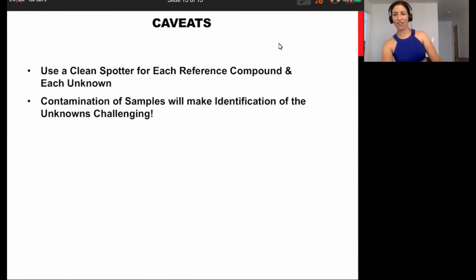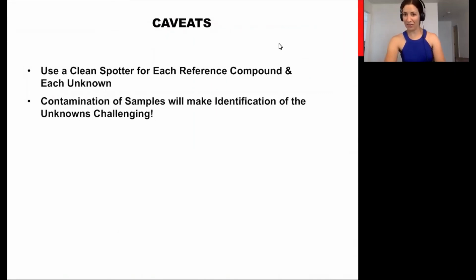Okay, so that concludes the theory of chromatography and all of the ways that it applies to TLC. Remember to use a clean spotter for each sample and to handle your plate at the edges with clean gloves. In Module 2, we'll take a look at how to separate molecules using what's known as column chromatography. It's a larger version of the TLC plate, and that will include all of the other logistics for Lab 1.